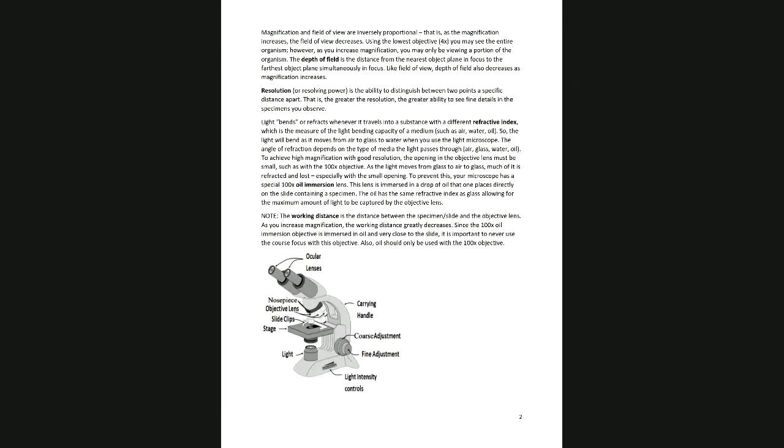And one of the things that students don't like to do is you see here there are two oculars on the microscope. How many eyes do you have? Yeah, two. So what does that mean? Yeah, right. You're supposed to use both eyes to look through the microscope. And there are ways to adjust it, so that it can fit your eyes, whatever the distance is between your eyes, or if your eyes are not equal, you can make adjustments so that it works for your eyes perfectly.